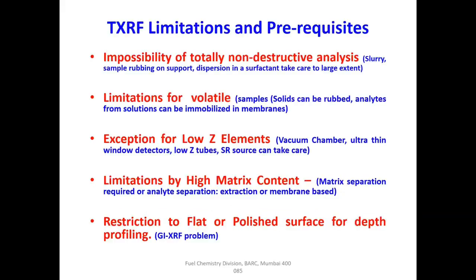Now these were the advantages of trace element analysis and speciation in TXRF. However, TXRF has certain limitations. These are some prerequisites and future perspectives also. These are general limitations: impossibility of totally non-destructive analysis. However, I saw in some slides and papers how we could tackle this. And there are other reports where non-destructive analysis has been done by TXRF.